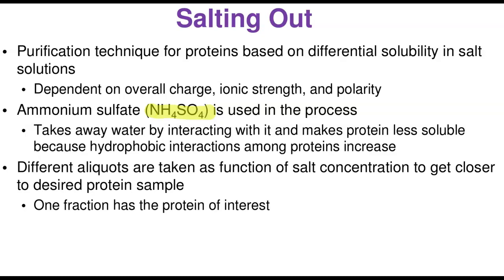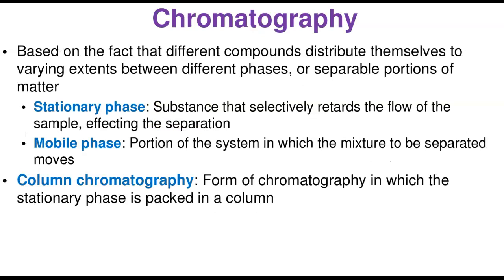And then we move to the next step, chromatography. Chromatography is an important technique that has gained a lot of attention and has actually contributed in purification of a lot of substances, not just proteins, purification and separation. So it's based on the fact that substances can distribute themselves in two layers. Those layers are the mobile phase and the stationary phase. Now, the stationary phase is the one that doesn't move. So what it simply does is that it retards the flow of substances in the mobile phase. And in such a process, there will be separation.